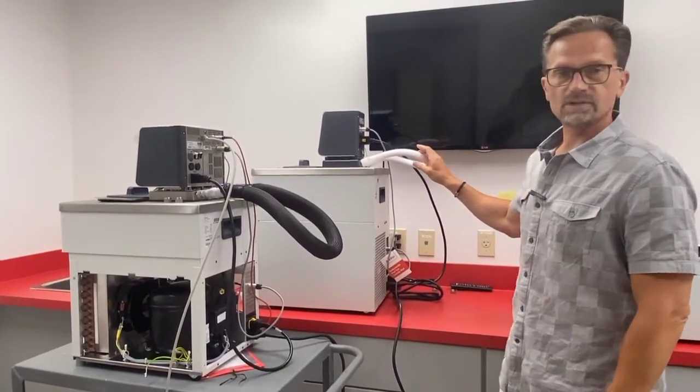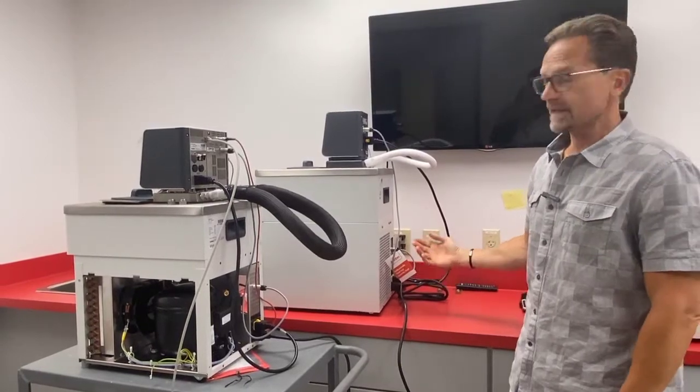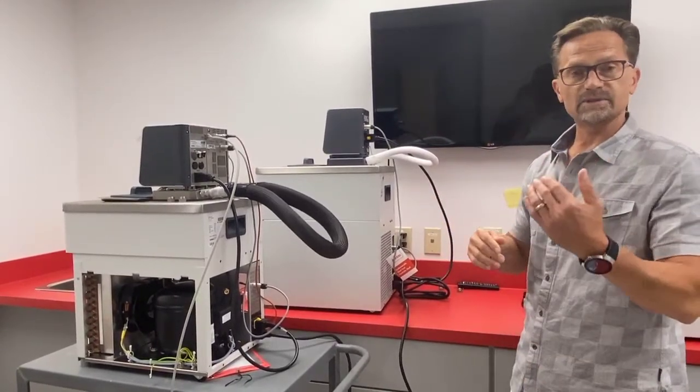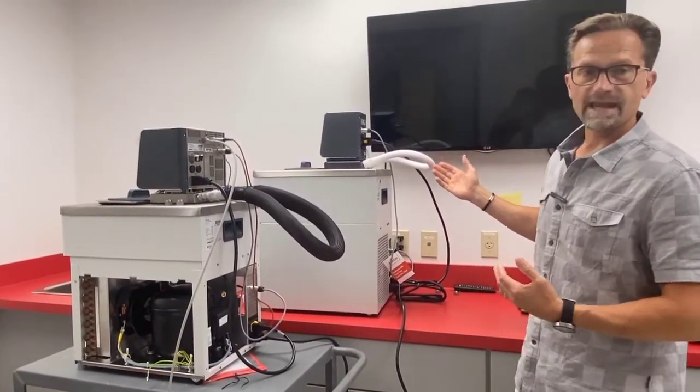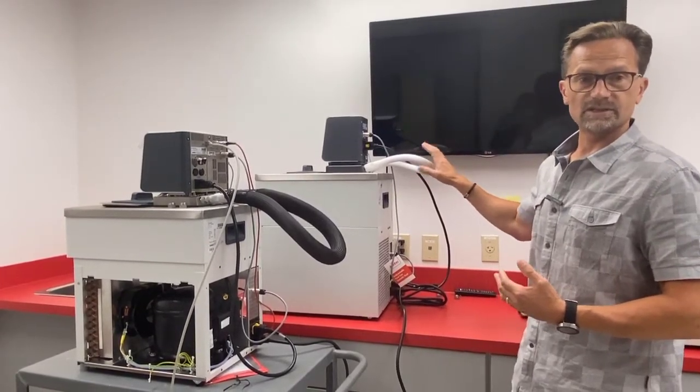So if you were to heat this up, this is going to melt and make a big mess in your lab. Now conversely, if you are at high temperatures, you can't tell from looking at it that it's hot, but you could have a potential contact hazard if someone touches that tubing.